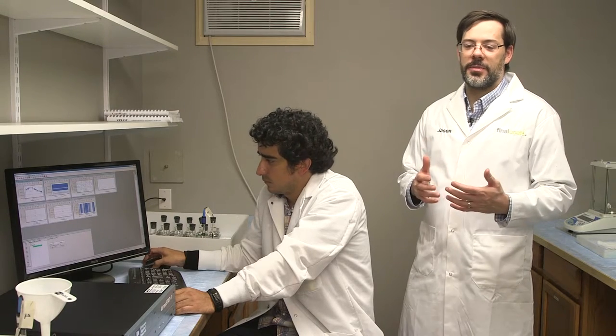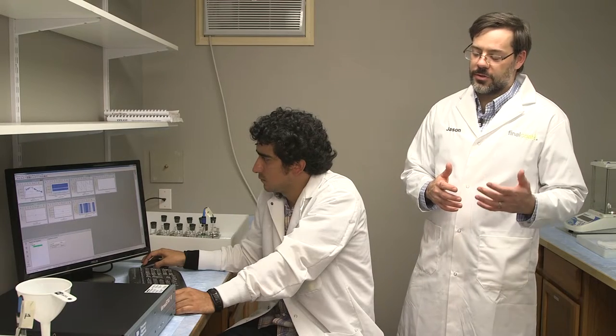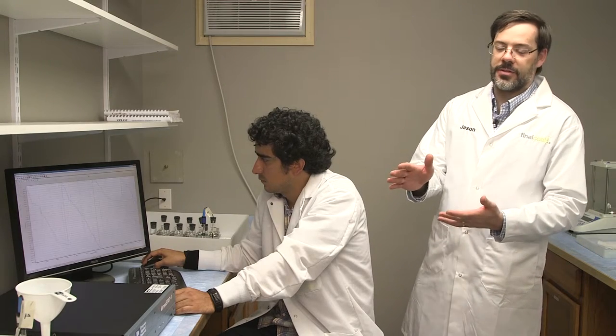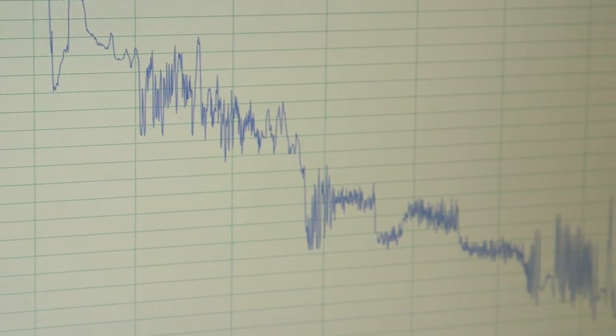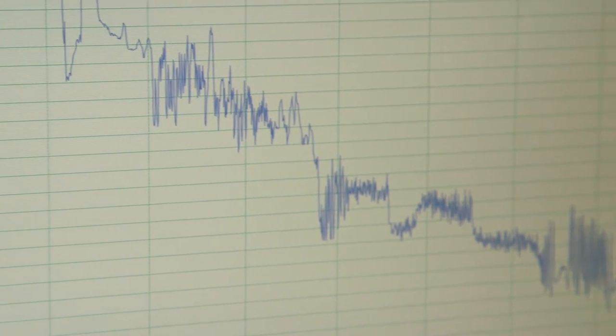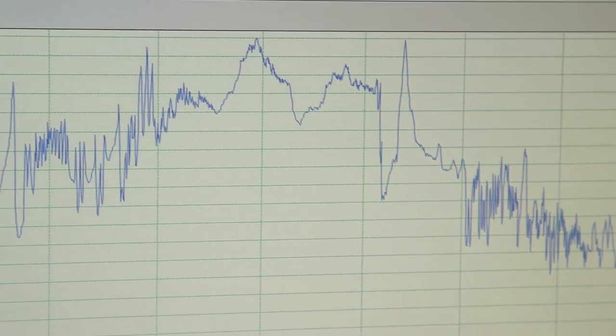The objective of our experiments is to directly test that hypothesis, and one of the tools we use for that is this computerized potentiostat right here. This is a very common tool in a corrosion lab, and it lets us do cause and effect experiments in a very systematic way.